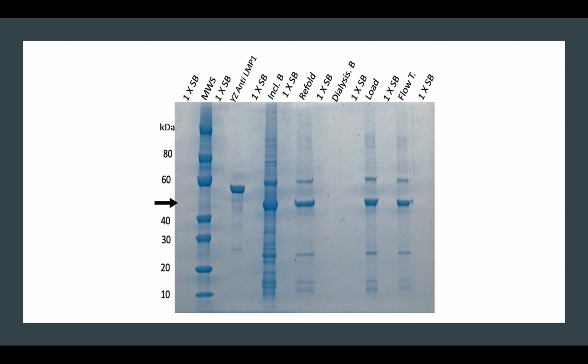However, with the flow-through, there is a band visible. This means that the discarded flow-through contains our protein. This was not what we predicted, as the protein did not stick to the column during anion exchange chromatography. Therefore, purification failed at anion exchange chromatography.